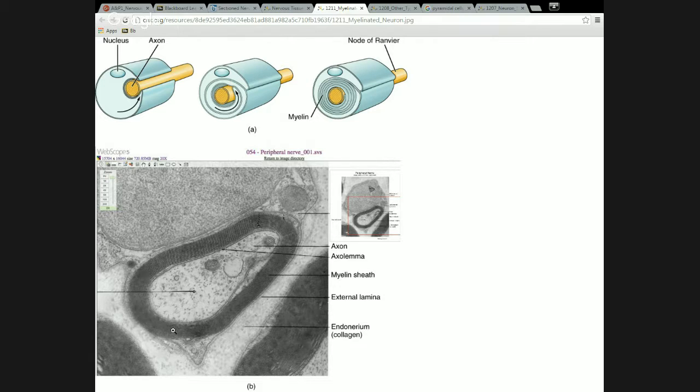The picture at the bottom is an electron micrograph, and it's stained with that same osmium stain, so that where there's lipids, we see dark staining. We're also staining this with another stain that's based on lead, and lead associates with proteins. So what we're seeing here is a very high resolution image of where there are lipids or proteins in this tissue. And with the kind of resolution we can get from an electron micrograph, we can figure out what we're looking at pretty easily.